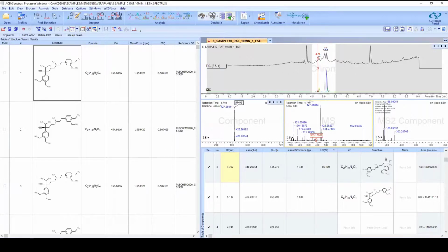So here we see this little database icon with the plus sign. And there are a variety of different ways to update the information into the database. All of these do allow you to do searches with the different tools that we've talked about today.